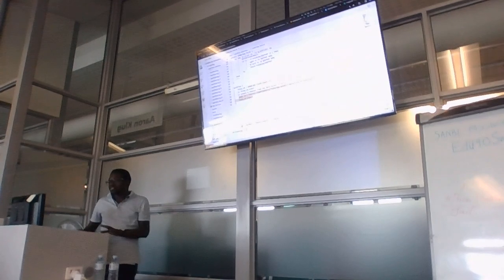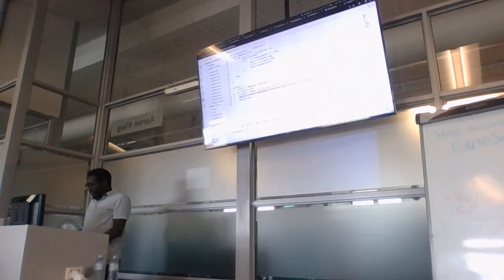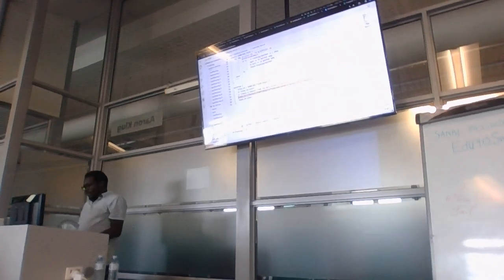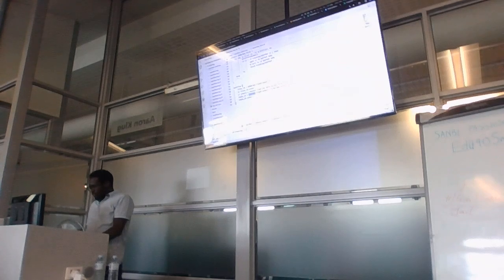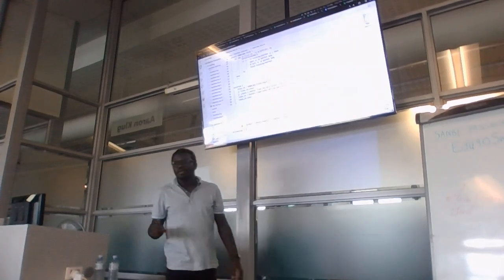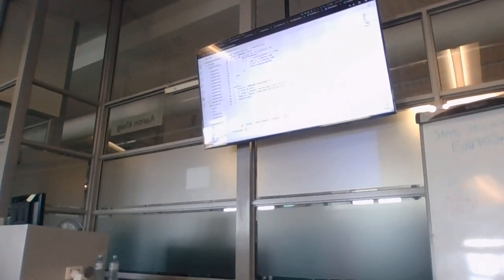The first process has run successfully. So before we went for lunch, we were creating a channel that will create file pairs from our read data, right? Are we all up to there? Do you have a channel which has now, yeah? In this statement here, in this line number 59. Make sure you have that.